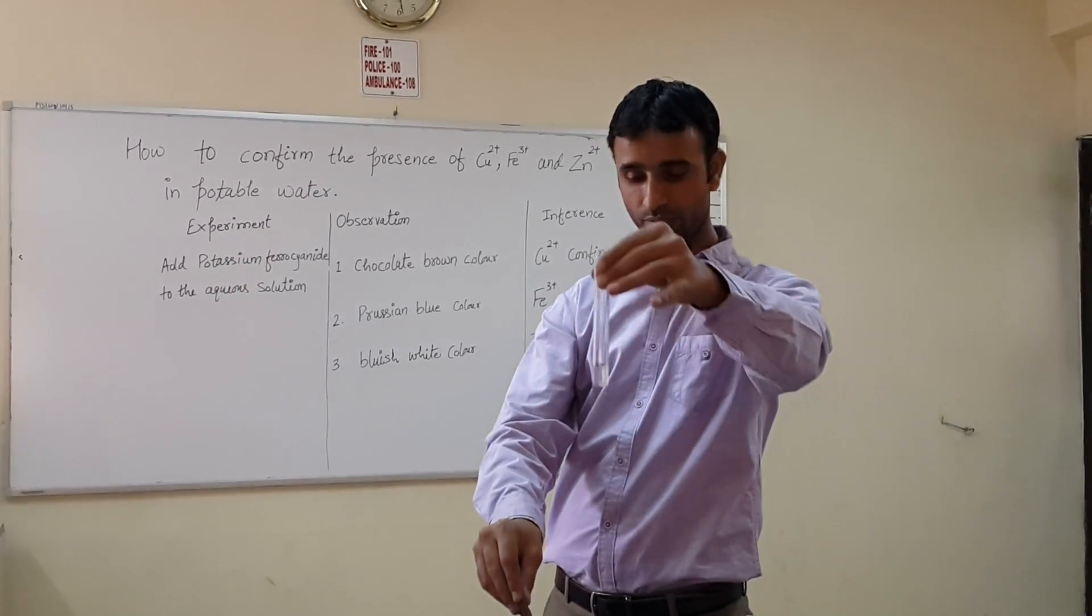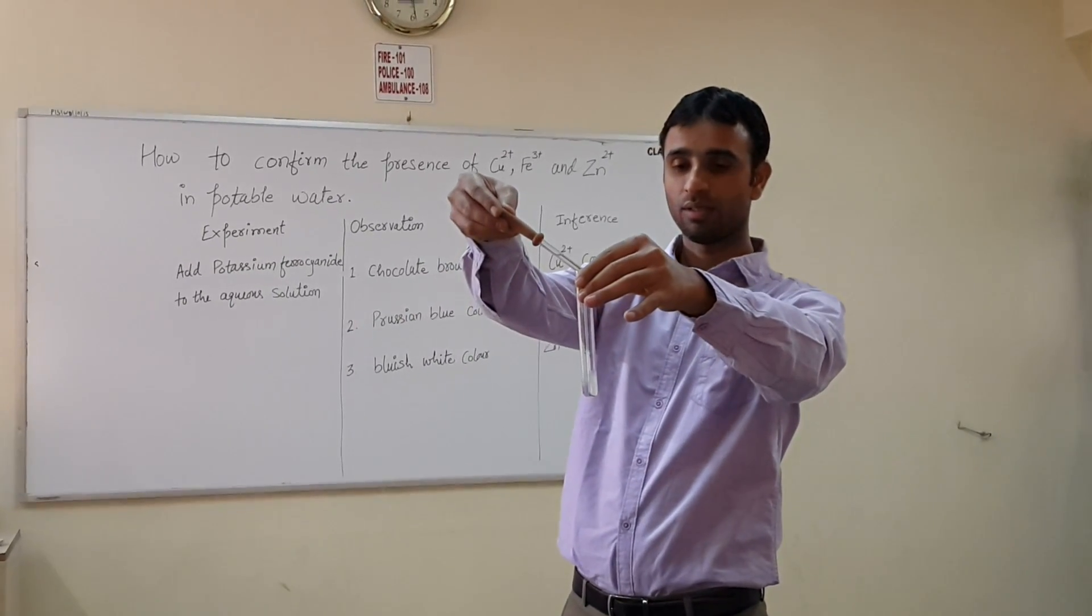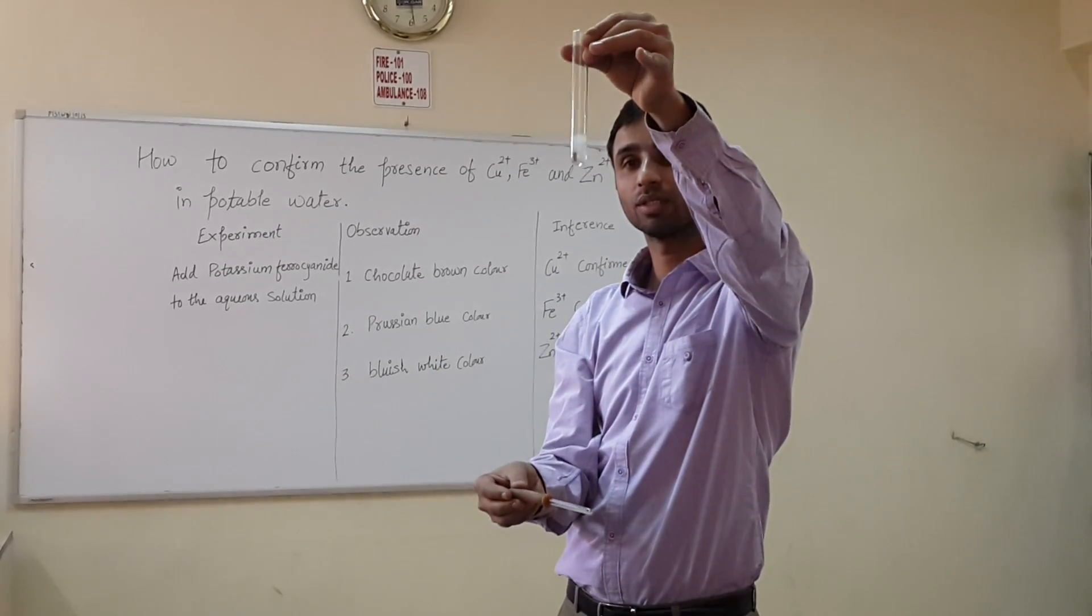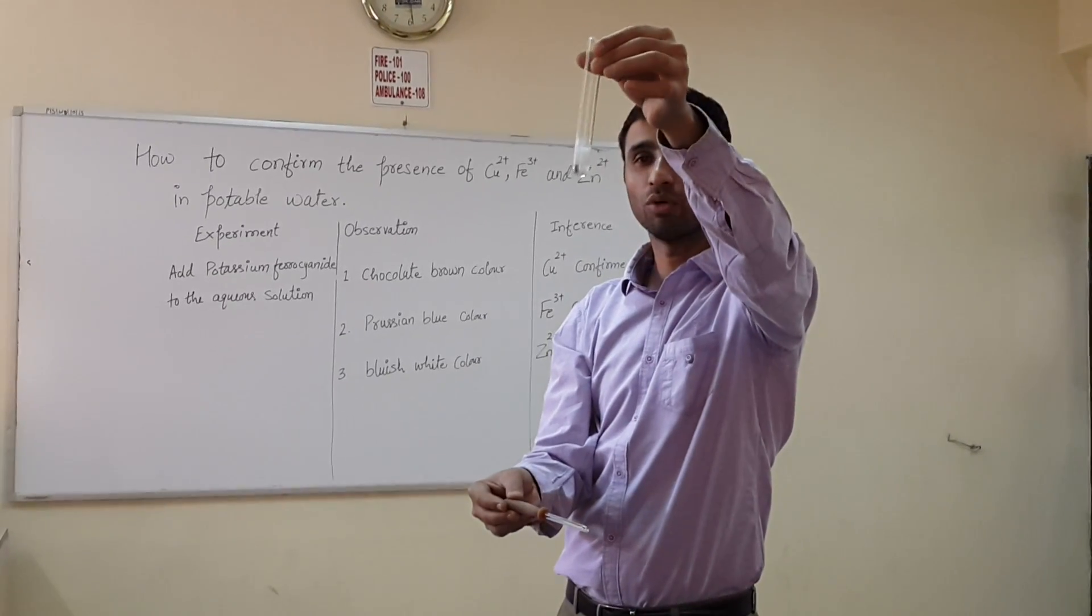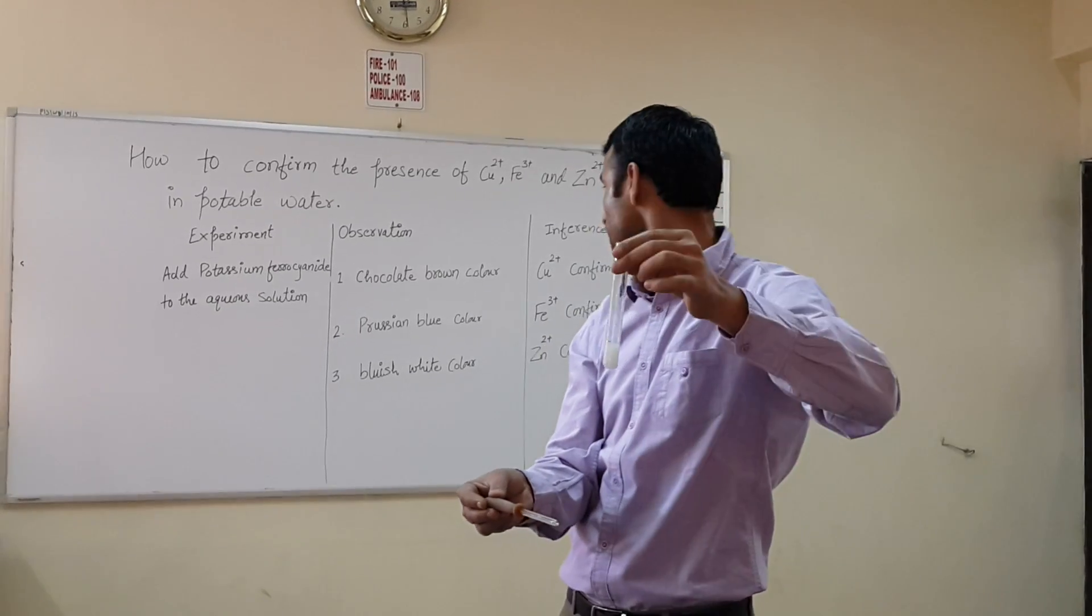This is the third solution. Now when we add potassium ferrocyanide, see, this is blue color. It is slightly bluish, meaning bluish white, that confirms the presence of Zn2+.